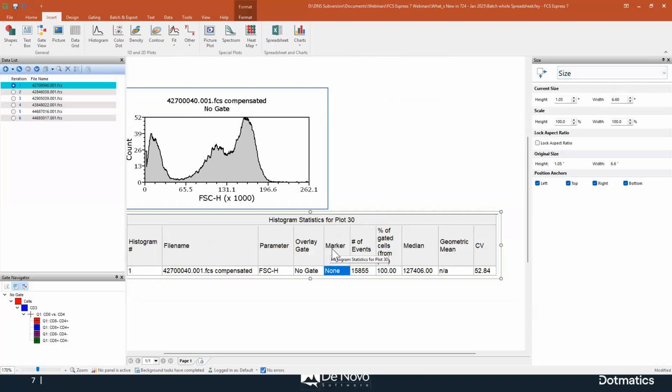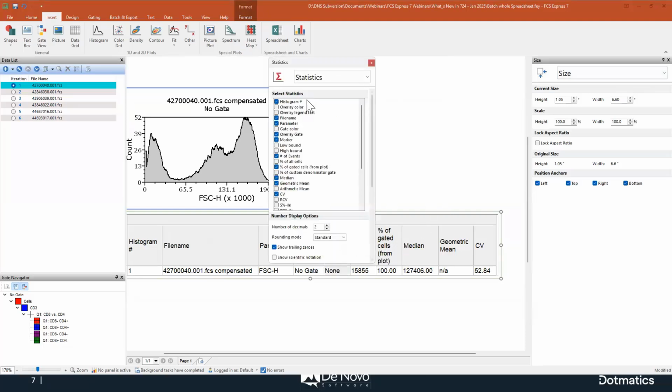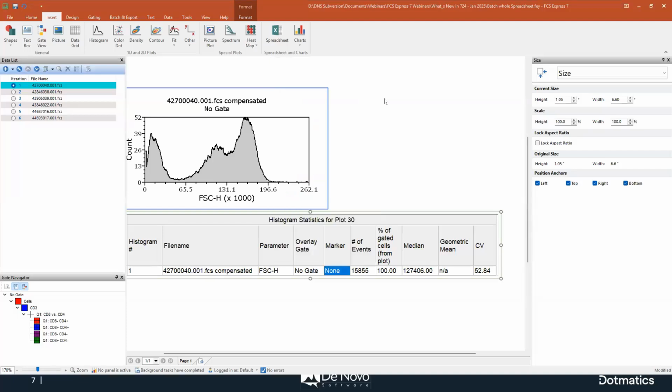So what we've done in 724 was checking this column by default so that it's visible every time you open a statistic table from an instrument. Again, if it's the first time that you install 724, then it's okay, you will see it. If you are updating from 722, then simply restore your user options.